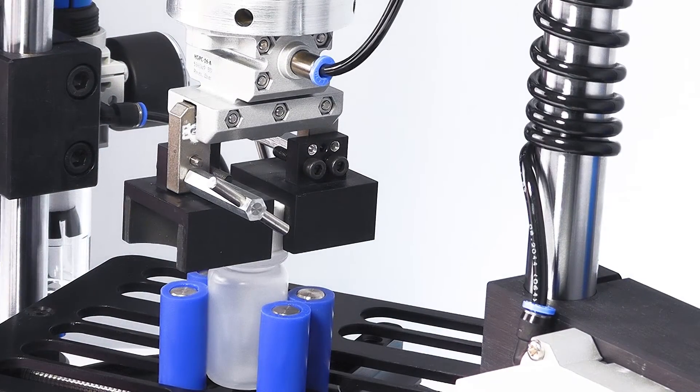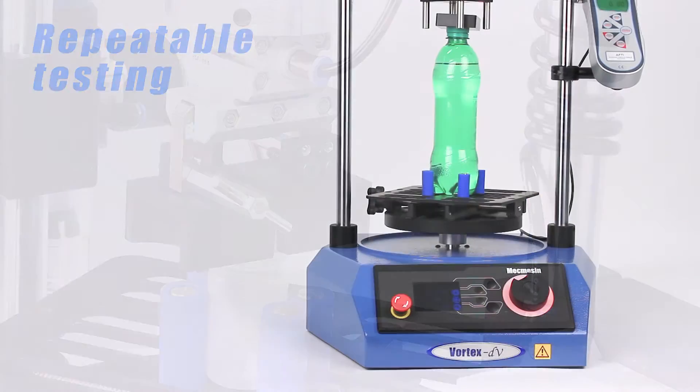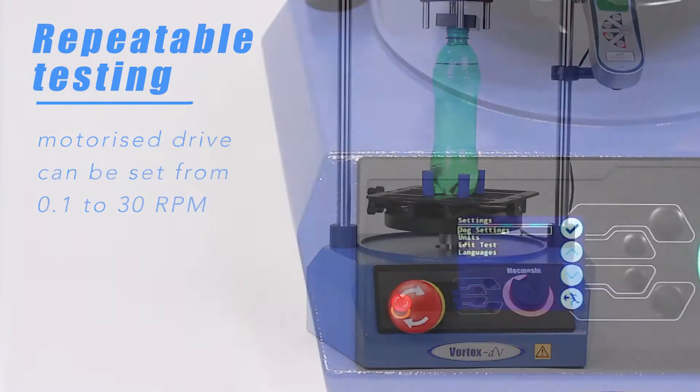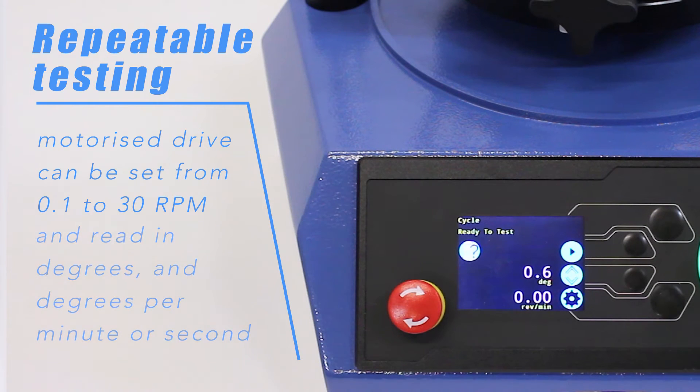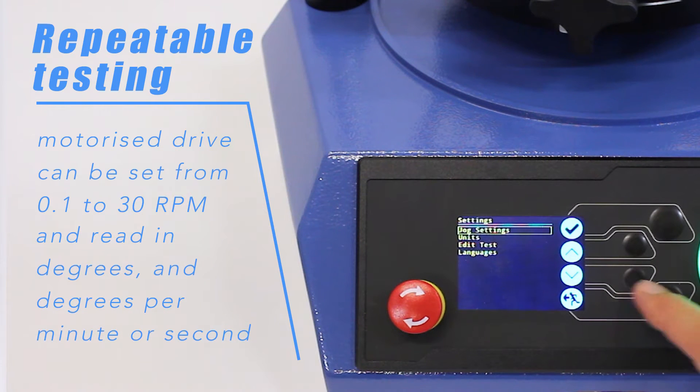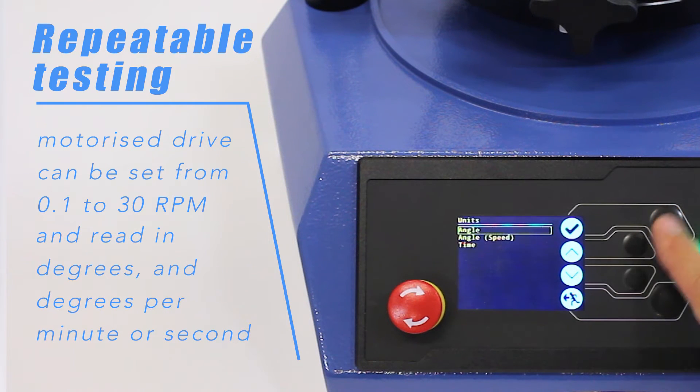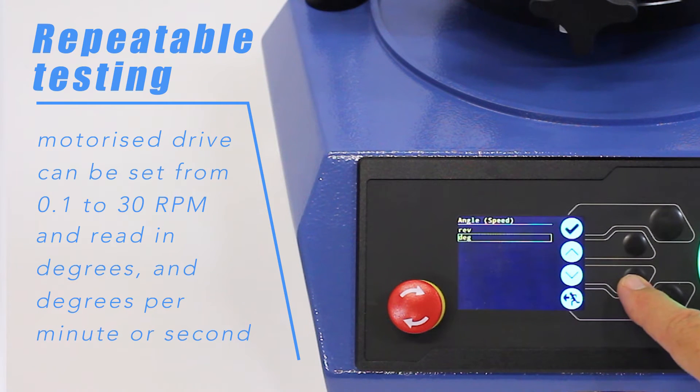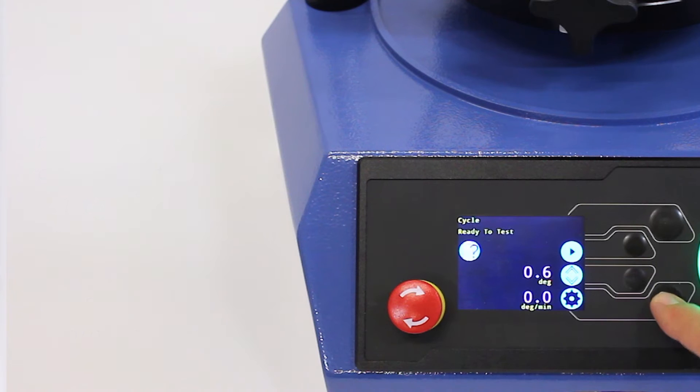To achieve repeatable results, the motorized drive rotates at a constant speed which can be set from 0.1 right up to 30 rpm. Depending on your preference, angular measurement can be reported in either revolutions or degrees. Speed may be set in either degrees or revolutions per minute or second.